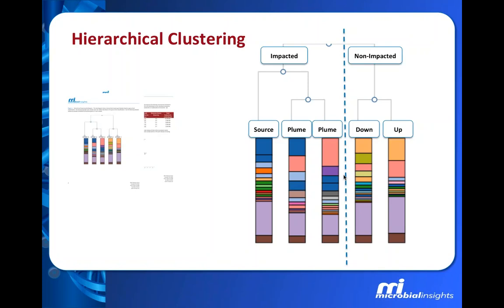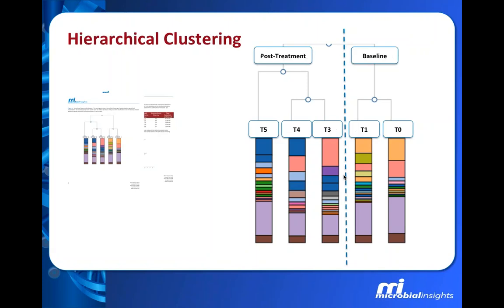And we find this very commonly to be a reasonable situation to see, because the presence of a contaminant can certainly exert a selective pressure on our microbial community. And we can see that some organisms will take advantage of that contaminant and really grow and thrive. Others may prosper under new geochemical conditions. Maybe it became more anaerobic in that area, so we start to see more anaerobic formation.